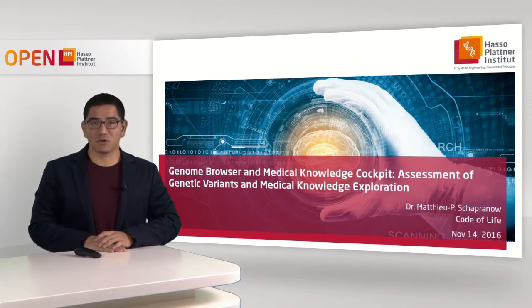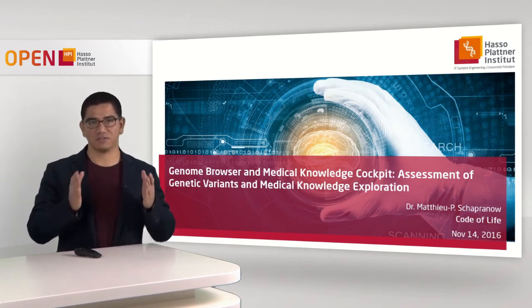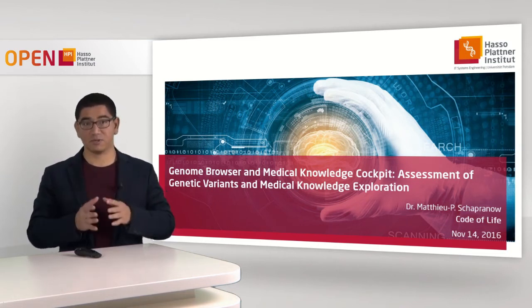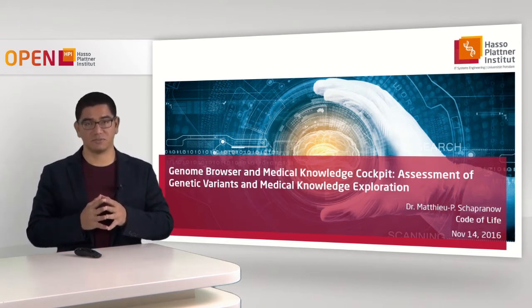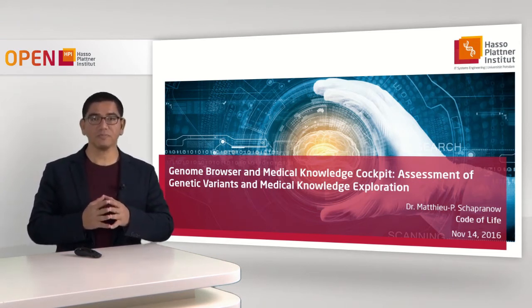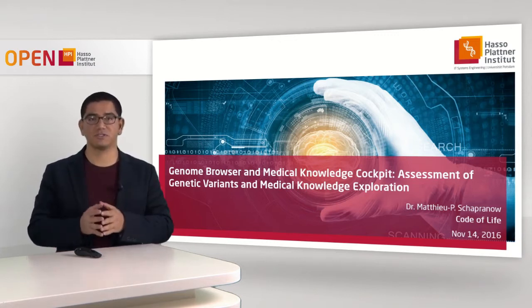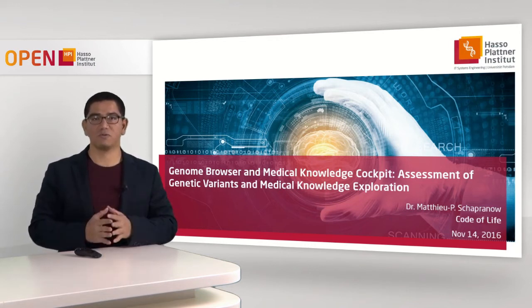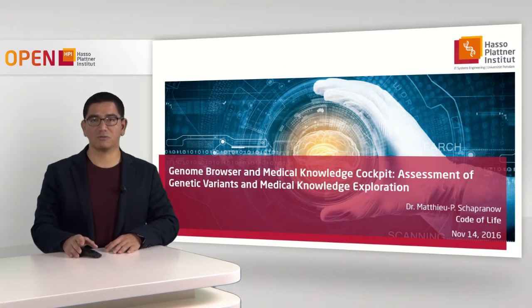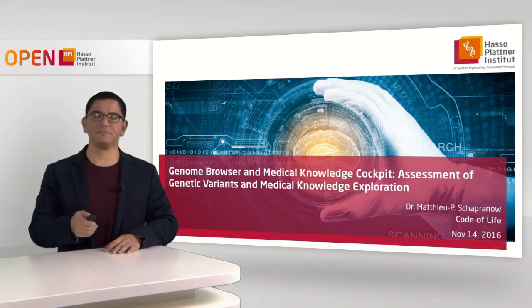One of our goals for the course was to provide you with some hands-on experience on genome analysis. For this purpose, we will have two tasks to be accomplished by you. One of them using the Genome browser and the other one using the Medical Knowledge Cockpit. So in this video, I will just show you briefly how to use the tools and how to extract the information you need to answer the exercises.